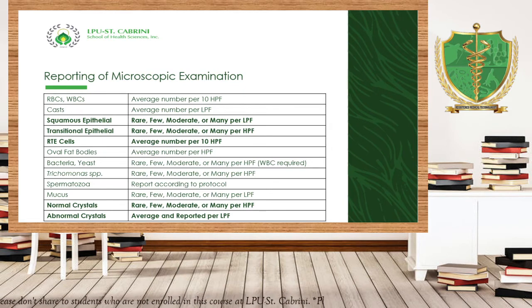So please remember, guys, that you will not always report the presence of bacteria in the urine if it was not really seen. Again, urine may or may not contain bacteria.